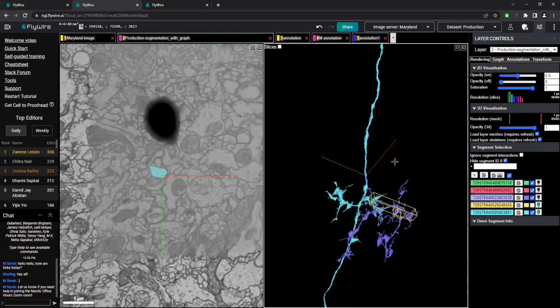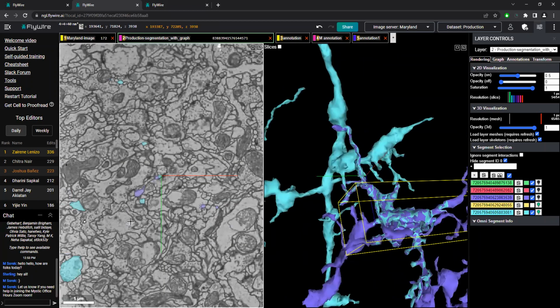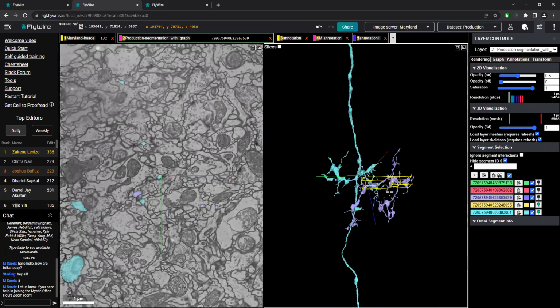This type of situation, where you start with one of these clusters and there's no obvious continuation spot, is one of the hardest things to do. So great job catching that. That's where our FlyWire experience of going through cube by cube, slice by slice really comes in handy. Any other questions? You can type in chat if you don't want to speak.